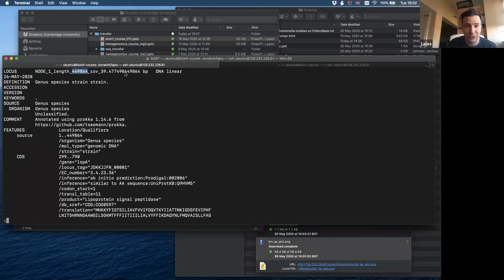And we also know that the size is here, but if you give this file to a program that understands the GBK format, it will probably drop an error, because it doesn't see the space between these two fields. There has to be a space.